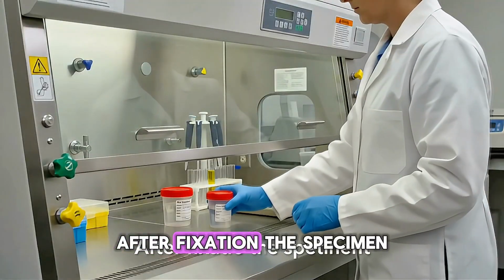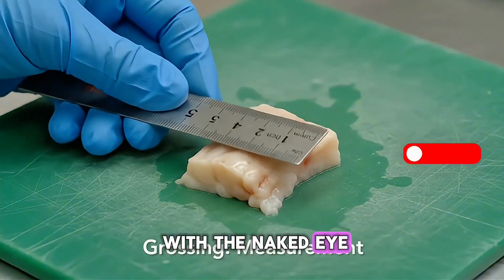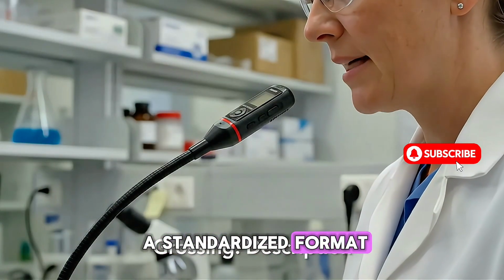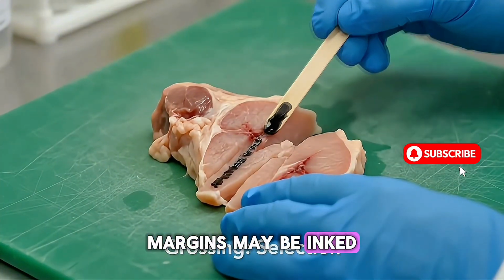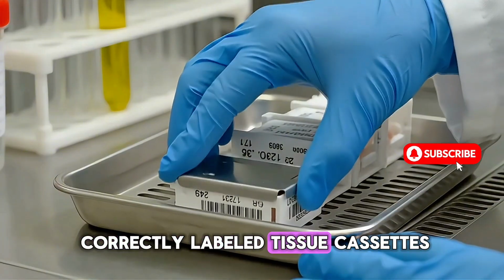After fixation, the specimen is grossed. The tissue is examined with the naked eye, measured, and described in a standardized format. Important areas are selected for testing. Margins may be inked, and representative pieces are placed into correctly labeled tissue cassettes.